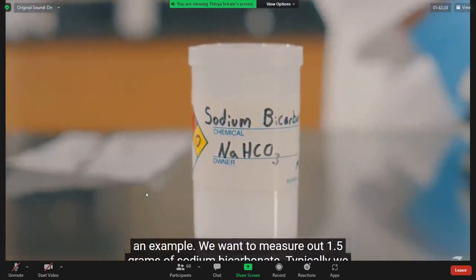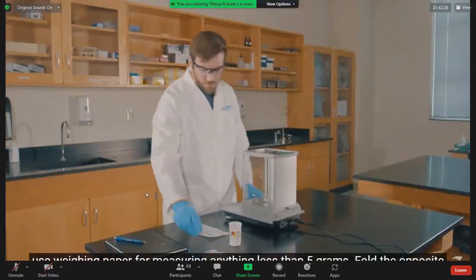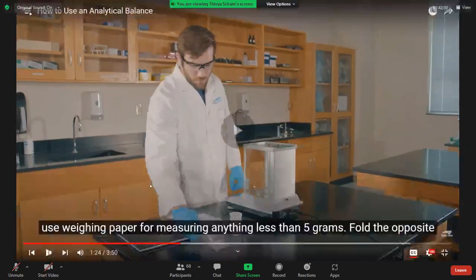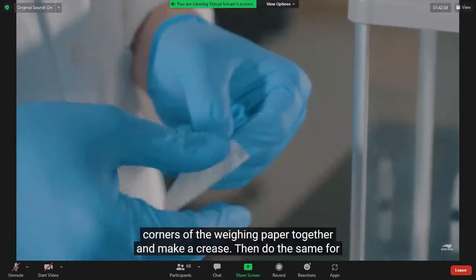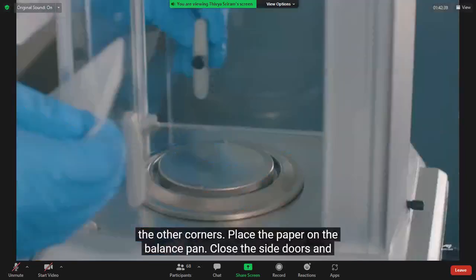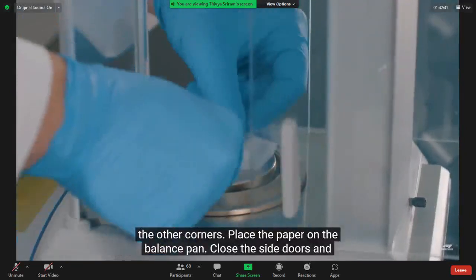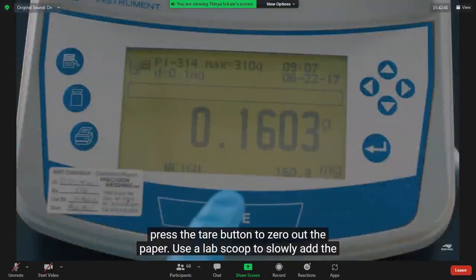Let's try an example. We want to measure out 1.5 grams of sodium bicarbonate. Typically, we use weighing paper for measuring anything less than 5 grams. Fold the opposite corners of the weighing paper together and make a crease. Then do the same for the other corners. Place the paper on the balance pan. Close the side doors and press the tare button to zero out the paper.